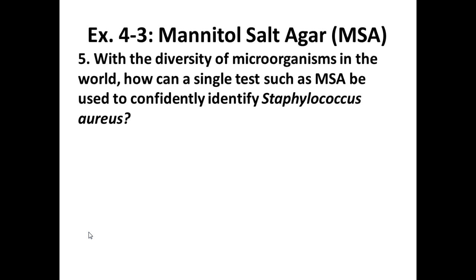Notice I prefaced this with, when we first did it, clinical specimens, right? So is this all stuff that maybe came from a person that we're working with in this lab? No. We actually are using some organisms that are environmental, right? And that could actually be resistant to salt.